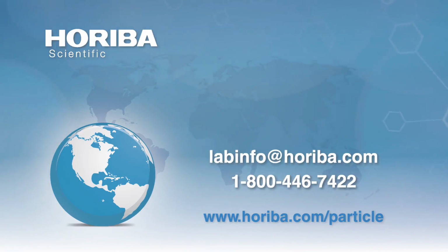The other is if you want to look at interactions between particles, say long-range electrostatic interactions. We don't have anything in the software that does it, but we can output the particle tracks. That's the good news: if you have a way of thinking about it, you can get some interesting data. The bad news is that the particle concentration is extremely low, and that means traditional long-range interactions, say charge interactions between latex particles, are pretty negligible because the particles are so far apart.